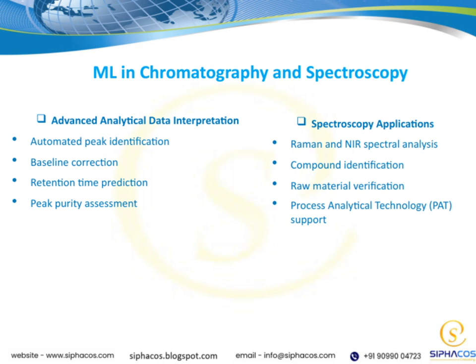Lastly, peak purity assessment helps us determine whether a single peak is truly pure or if it contains multiple components, which is vital for quality assurance. All these applications come together to support more intelligent, efficient, and reliable analytical workflows, aligning perfectly with our overall goal of advancing pharmaceutical and chemical analysis.